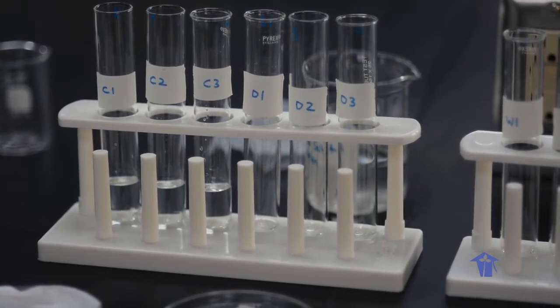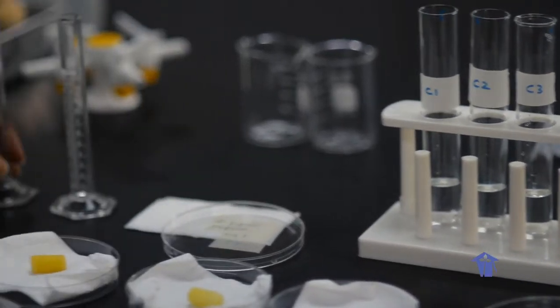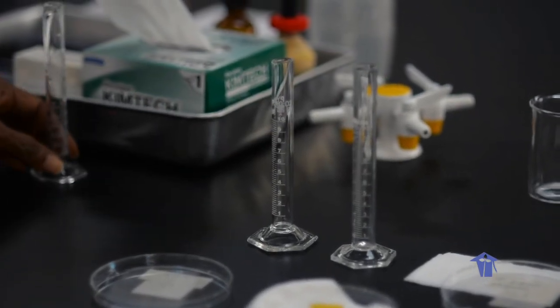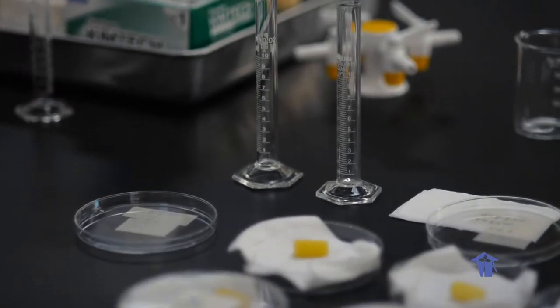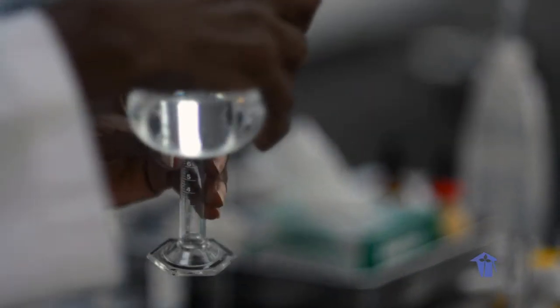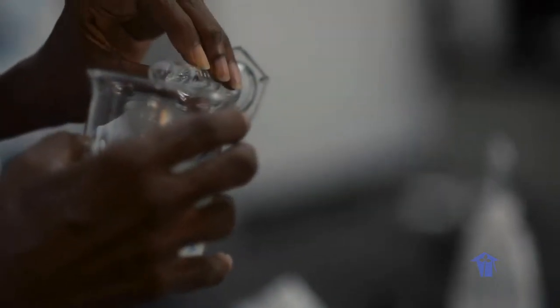Right, to avoid mixing of the solutions, I'm using 3 different measuring cylinders, one for each of the solutions that I'm using in this experiment. So I'm finished now with using the cylinder to measure the concentrated salt solution. And the next one that I'm going to measure would be the dilute solution. I'm using a different measuring cylinder for that, and the same volume that I used for the concentrated solution, which is the 10 mils.